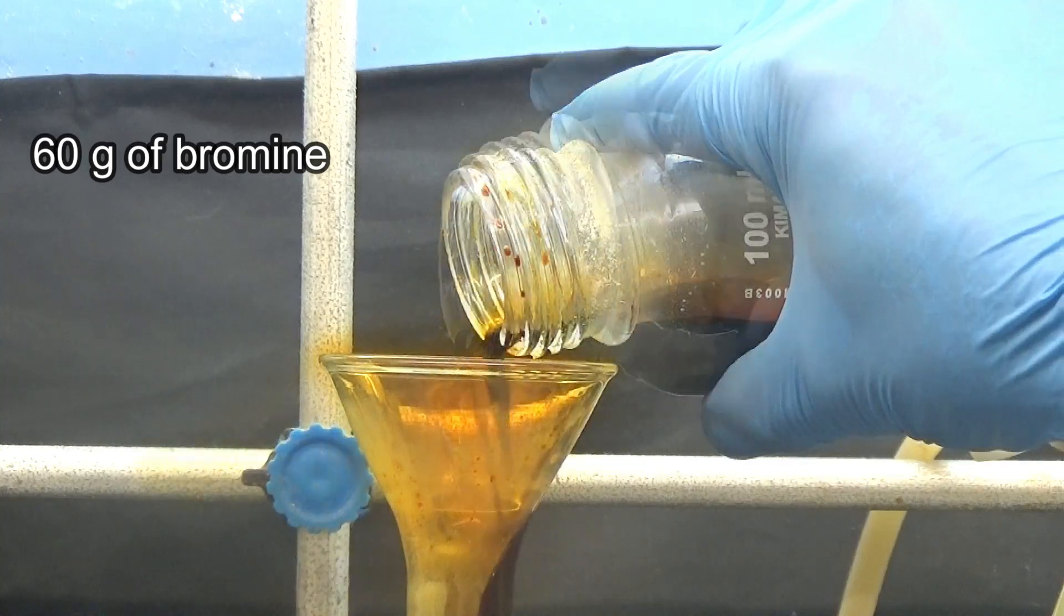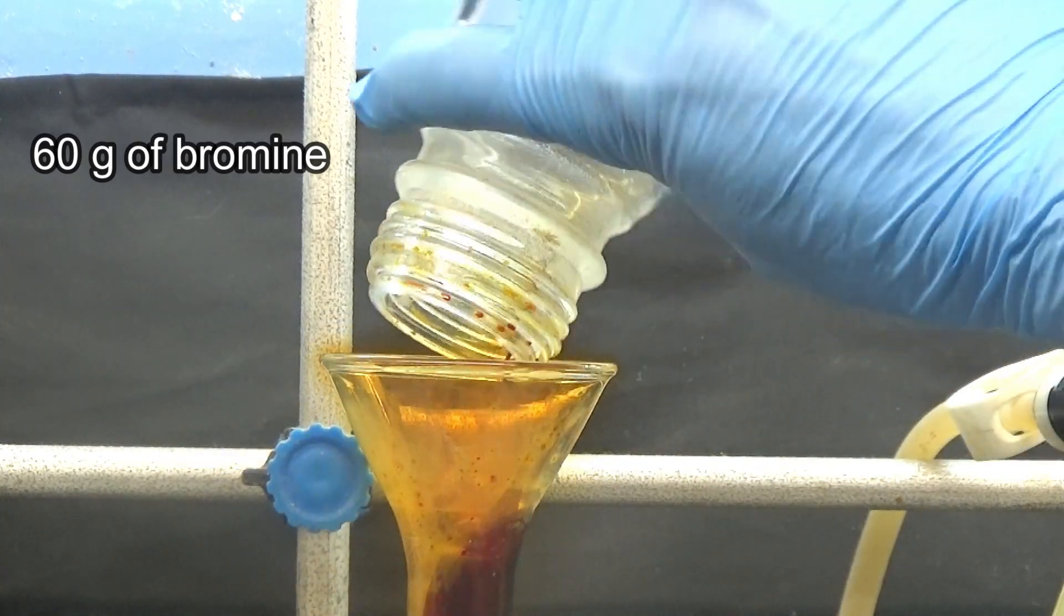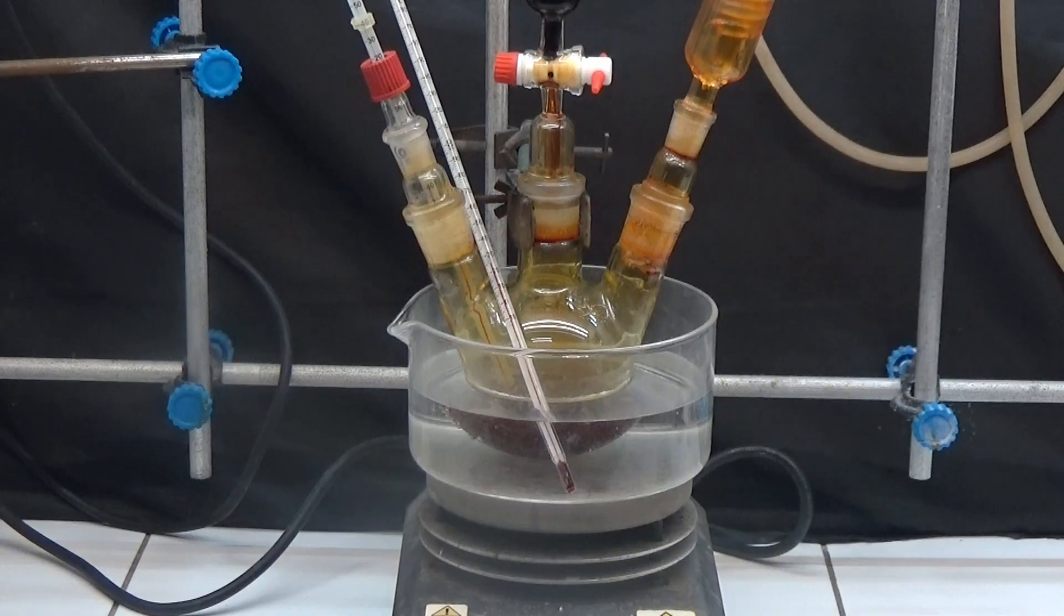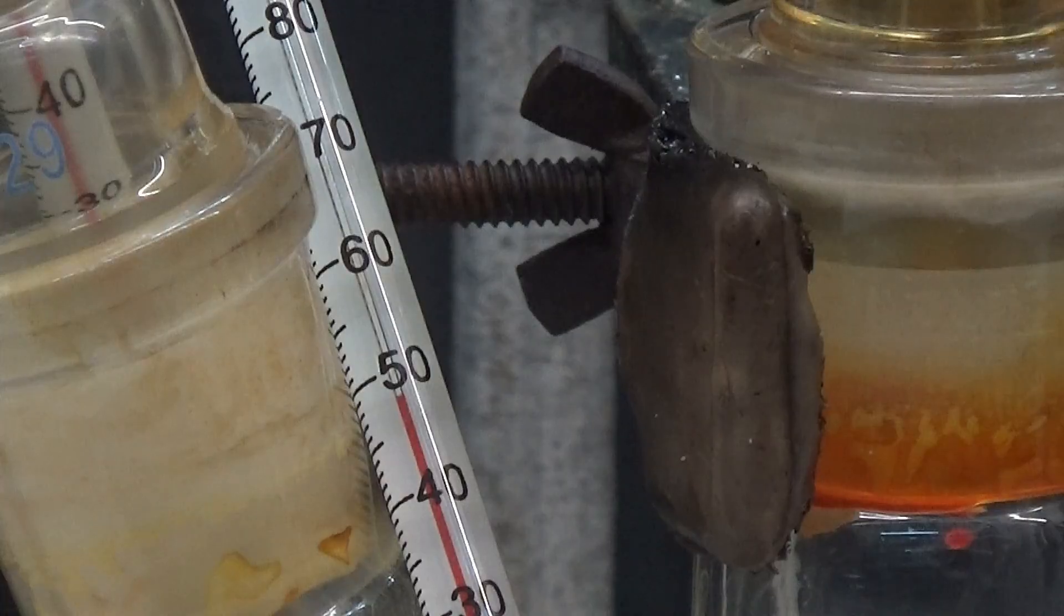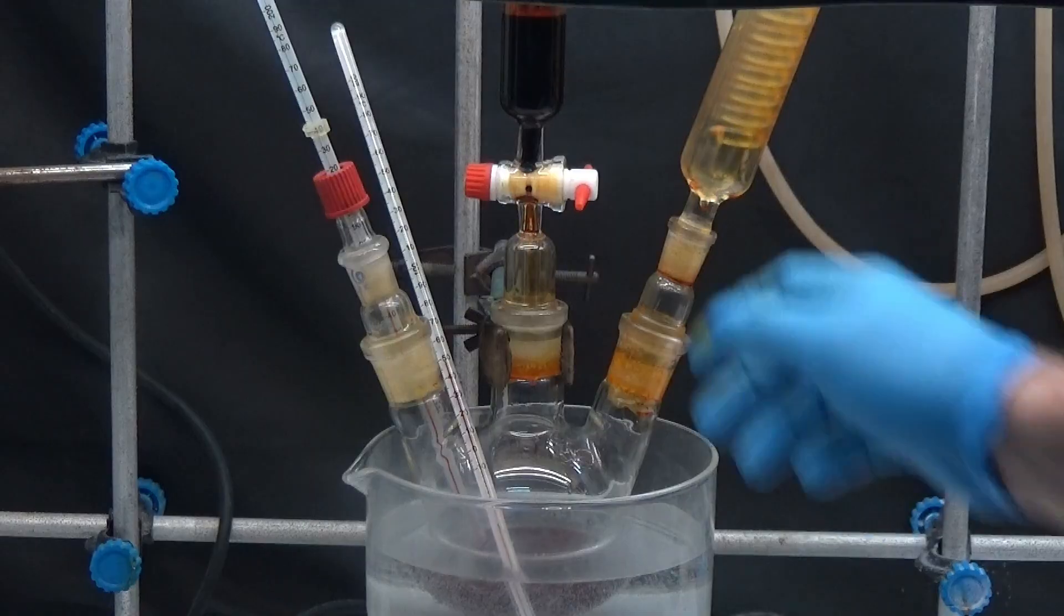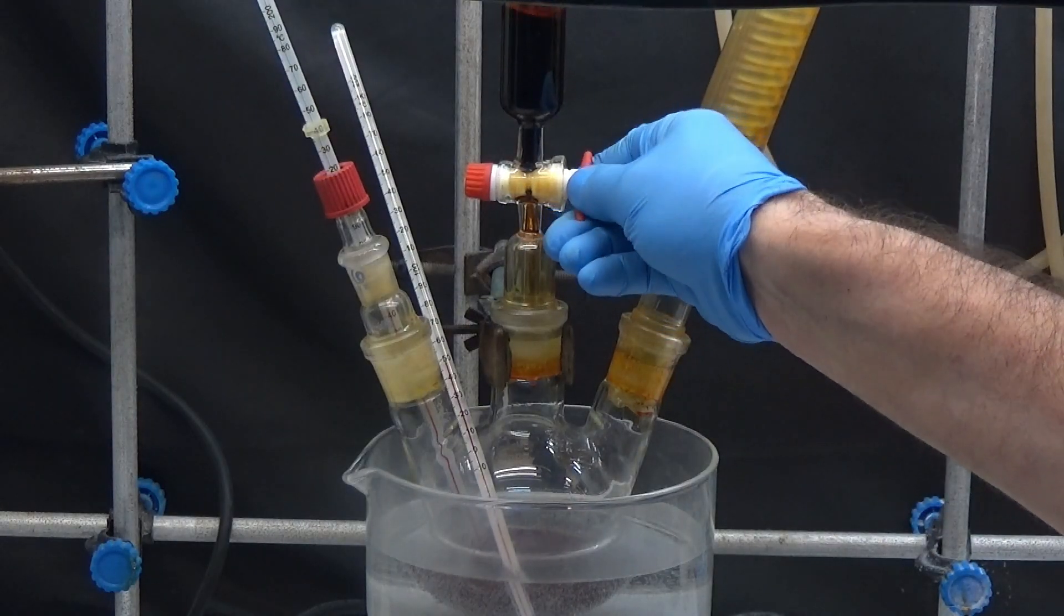After adding 30 grams, we added 60 grams of bromine to the addition funnel. The water bath should be kept below 50 degrees. We slowly add 60 grams of bromine.